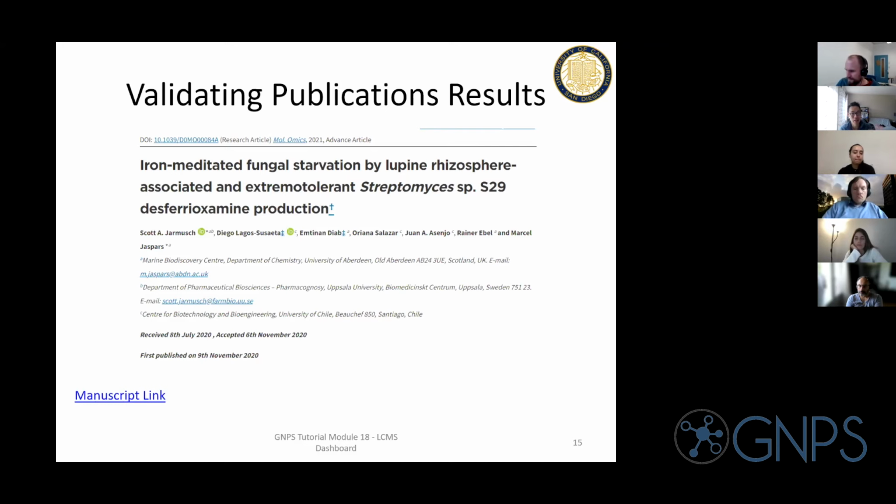But one application that Danny highlighted is the ability to look at your own data. As you're doing your analysis, you can quickly hop over to the reasonably raw data, look at the chromatograms, the heat maps, and the MS2 that you're hopping around on. We think that saves time, especially for grad students and postdocs that look at the data.